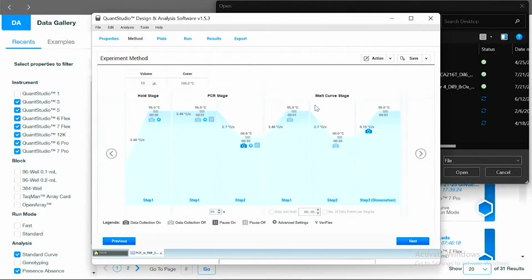Okay. And one of the checks we can do on that is running a melt curve. That melt curve can give you information about the quality of your product: the width of the melt curve can tell you about the amount of side products, or additional peaks can tell you information about specific side products. So there are definitely some metrics that we can take out of the melt curve and apply to the quality of our data. So definitely during the development stage, I highly recommend a melt curve.